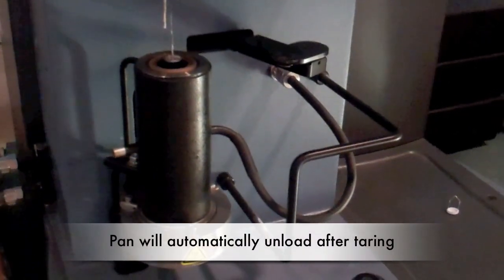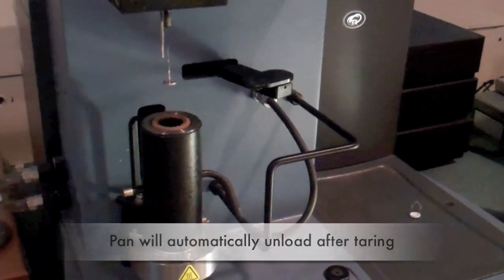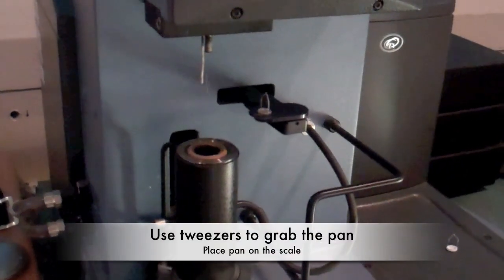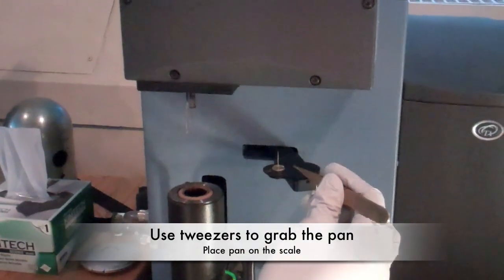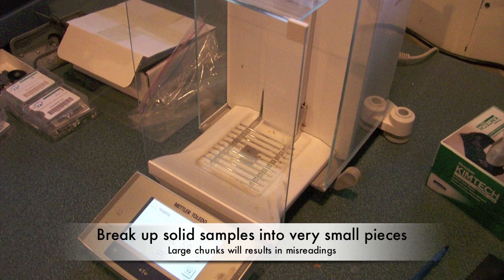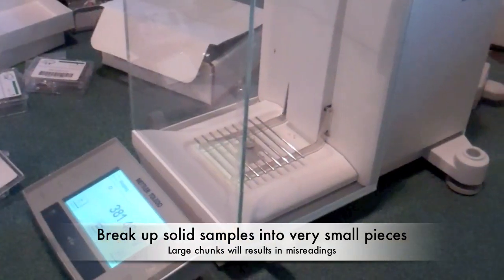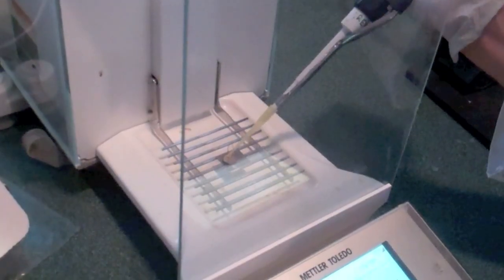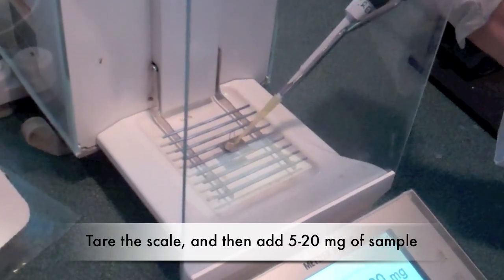After the tearing is complete, the pan will automatically unload. Use tweezers to grab the pan and put it on the scale. If your sample is neither liquid nor powder, take this time to grind or cut your sample into as small pieces as possible. Large chunks will bubble during degradation and bounce the pan around.